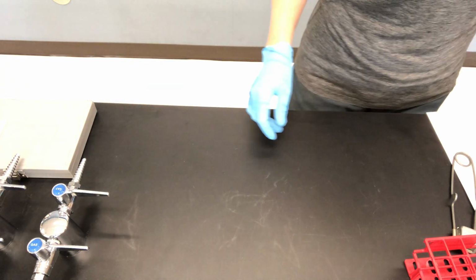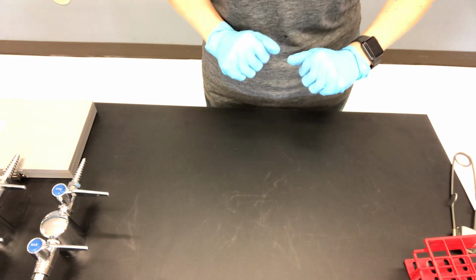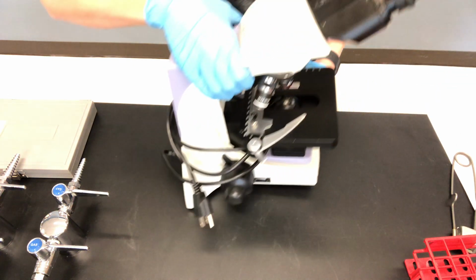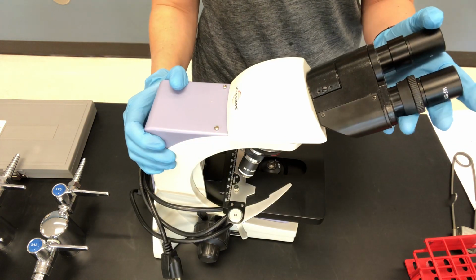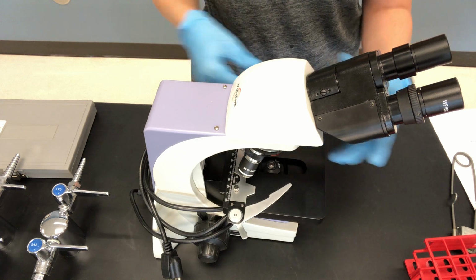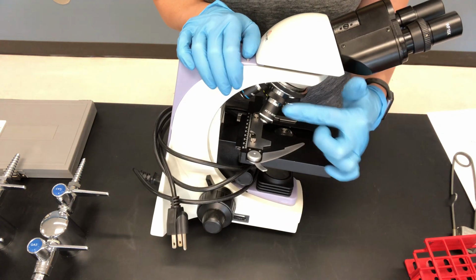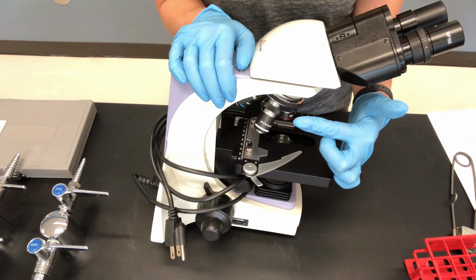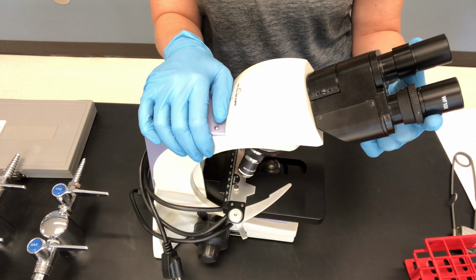So really, in all of the labs that we're doing, you just need to be able to know how to use a microscope, and that's what we're going to do next. So I've got one handy dandy right here. So this is our compound light microscope. And the reason why it's called compound is because there's lenses in the ocular and there's objective lenses. And to find the total magnification, you multiply. So our oculars are always 10x.